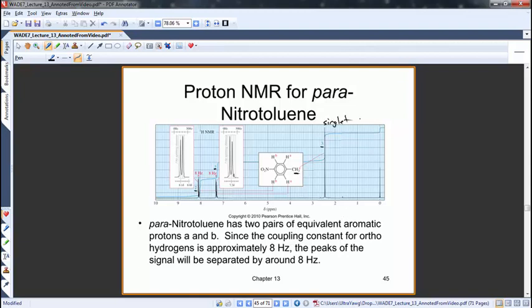And it is. Notice it's a singlet not in the 0.5 to 1 to 1.5 range, but because it's on the benzene ring and you get that ring current, it's shifted downfield, deshielded a little bit.